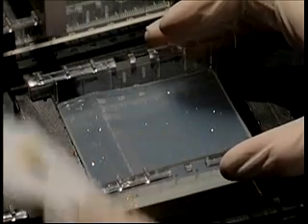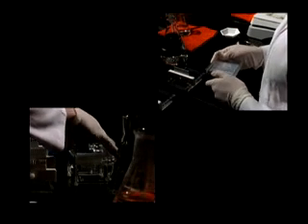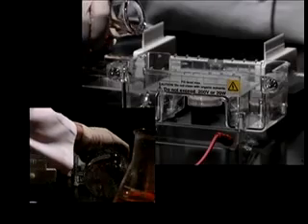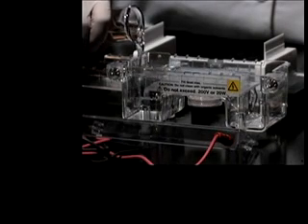Once the gel is solidified, carefully and slowly remove the rubber dams and comb. Place the gel bed into the electrophoresis chamber, centered and level on the platform. Fill the chamber with diluted buffer. This type of gel is often called a submarine gel because it's submerged under a buffer.